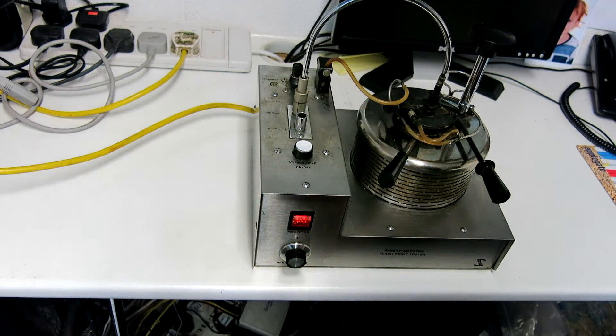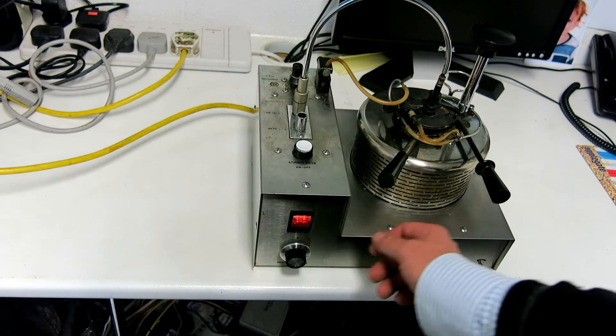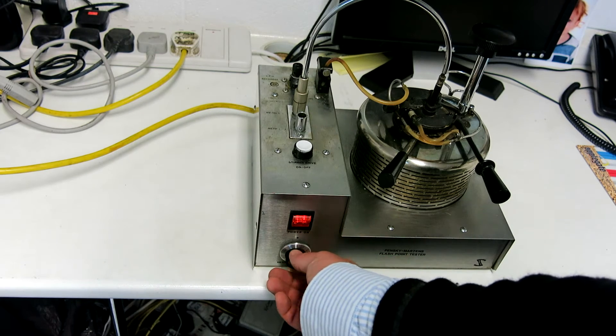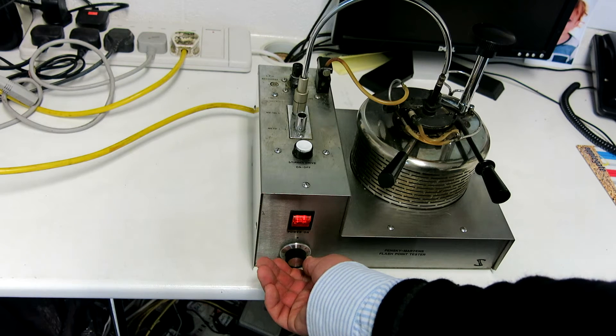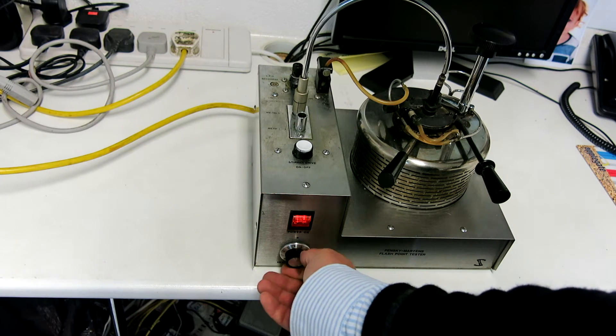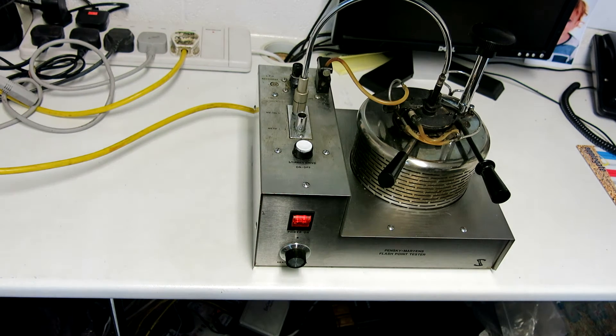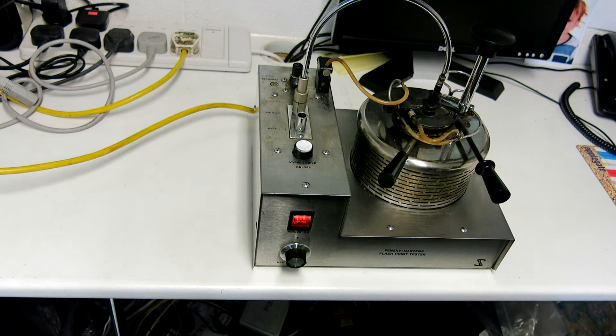We've got a heated control at the bottom here which heats the jacket that the pot goes into. So that's variable there and you can see that it's variable. Condition of it doesn't look like it's had a massive amount of use to me. It's made by CETA, a well-known manufacturer of this sort of equipment.